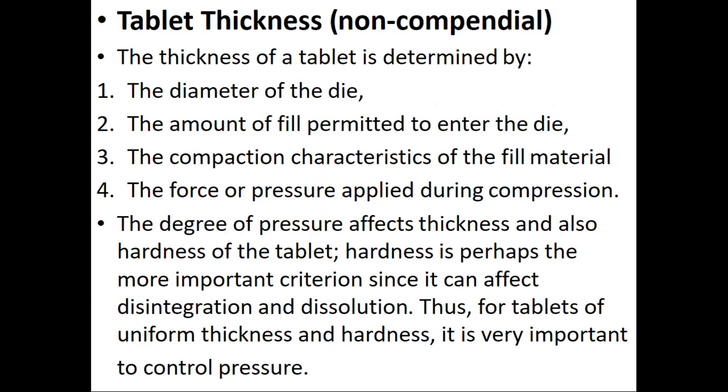Now let's talk about tablet thickness. This test is non-compendial, but it is required. The thickness of a tablet is determined by some factors: diameter of die, the amount of fill permitted to enter the die, the compaction characteristics of the fill material, and finally the force or pressure applied during compression.